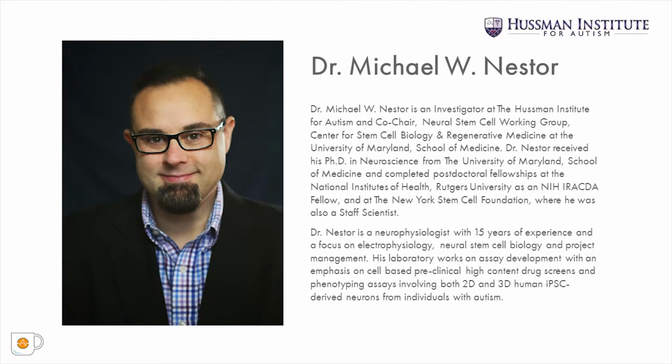Today's presenter, Dr. Michael Nestor, is an investigator at the Hussman Institute for Autism and the co-chair of the Neural Stem Cell Working Group at the University of Maryland School of Medicine. He is a neurophysiologist with 15 years of experience and a focus on electrophysiology, neural stem cell biology, and project management. In particular, his laboratory works on assay development with an emphasis on cell-based preclinical high-content drug screens and phenotyping assays involving both 2D and 3D human iPSC-derived neurons from individuals with autism. He will discuss how studying the spontaneous firing activity of patient-derived iPSC neurons in an MEA assay is helping to build a model of autism.